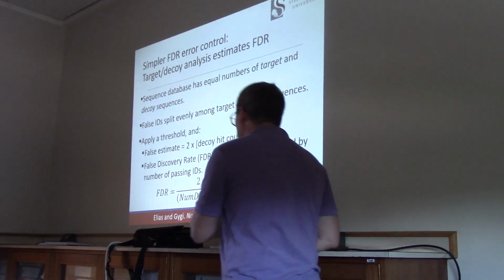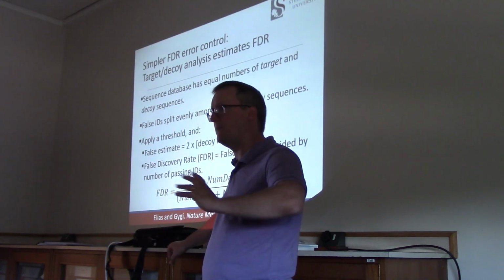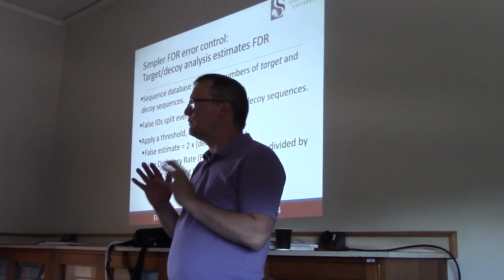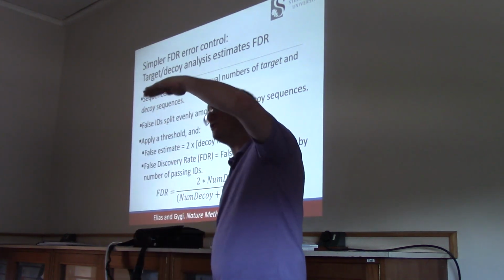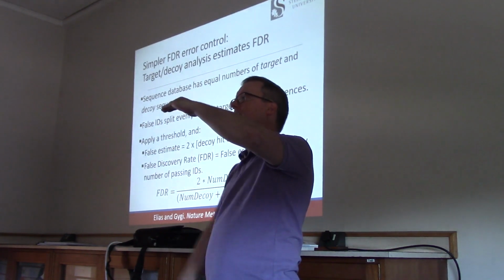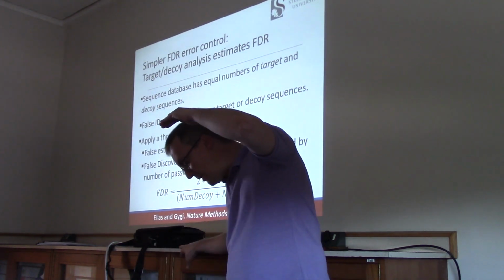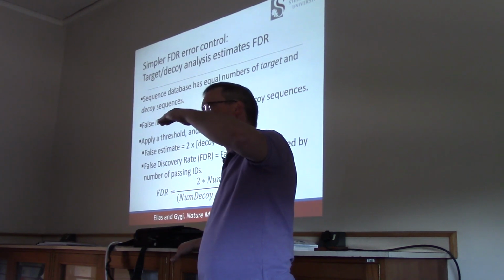All right, now let's look at an easier approach. This is one that gets used all over the place, so it's worth knowing about. Let us imagine that we have some score to represent each PSM. Maybe it's just the search engine score. So you can imagine that I've got them stacked under my hand here. Way here at the top, I have the best scoring PSM out of the entire raw file, the entire gradient. Down here on the floor, I have the very worst PSM we saw, the very lowest scoring one.